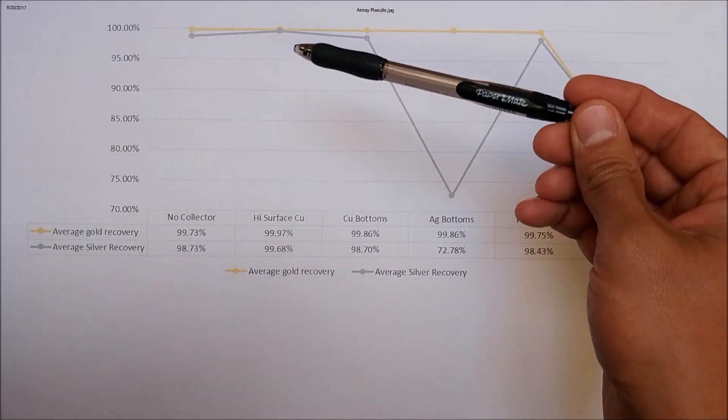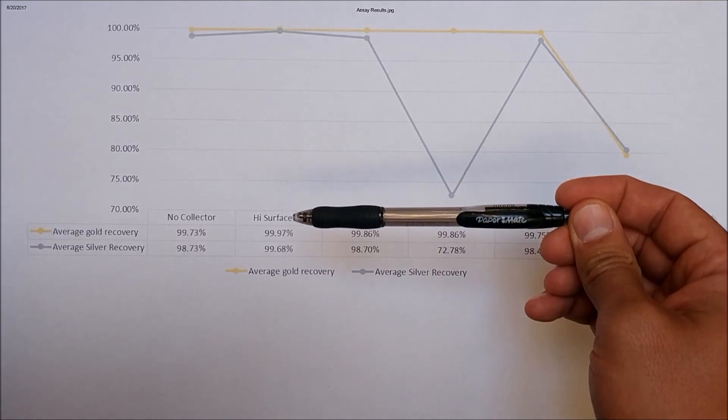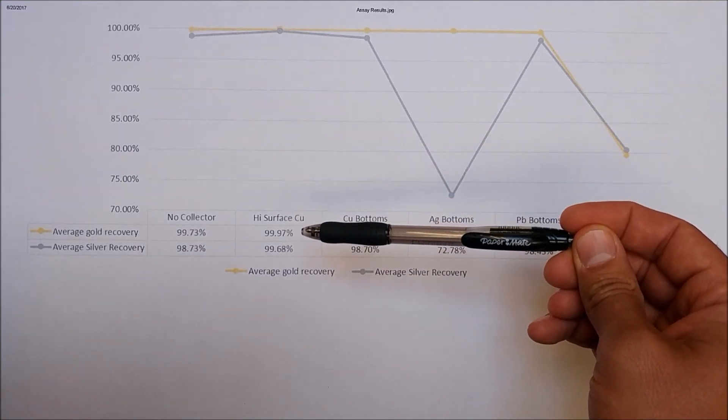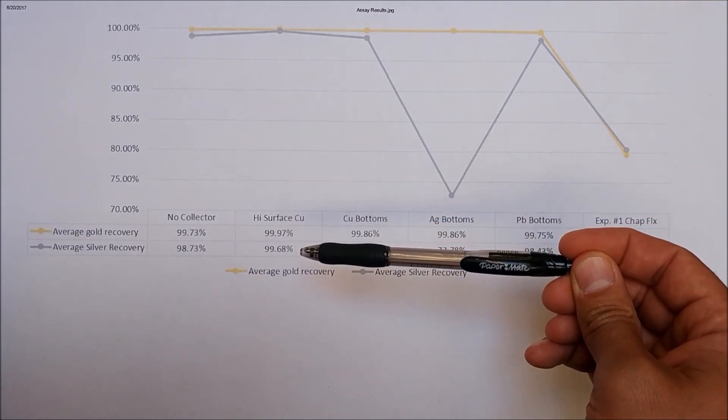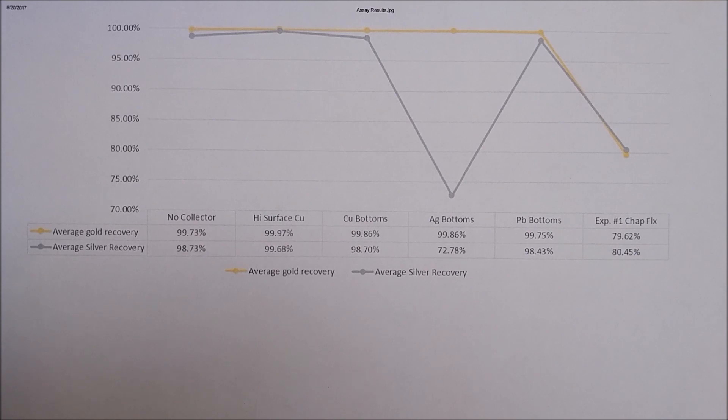The high surface area copper was actually even better. There was three nines recovery of the gold and 99.68% recovery of the silver.